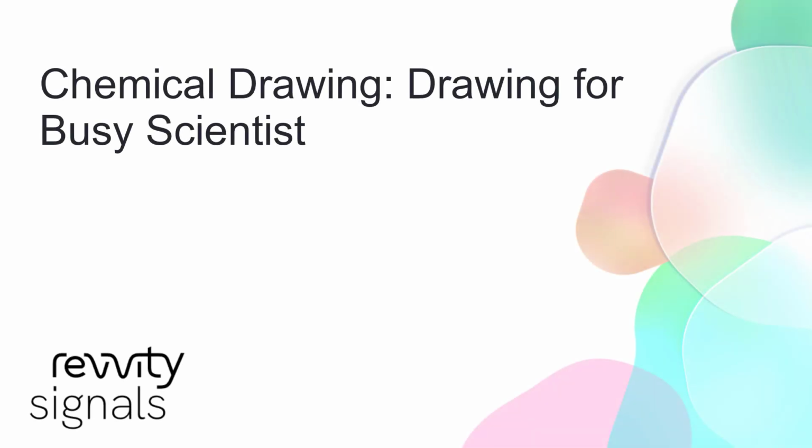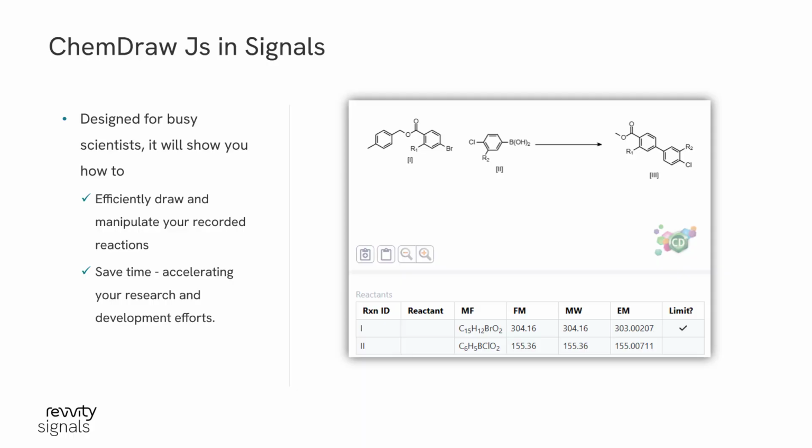Welcome to Signals Notebook. This video will guide you through working with chemical drawings within your experiments. Designed for busy scientists, it will show you how to efficiently draw and manipulate your recorded reactions, saving time and accelerating your research and development efforts.